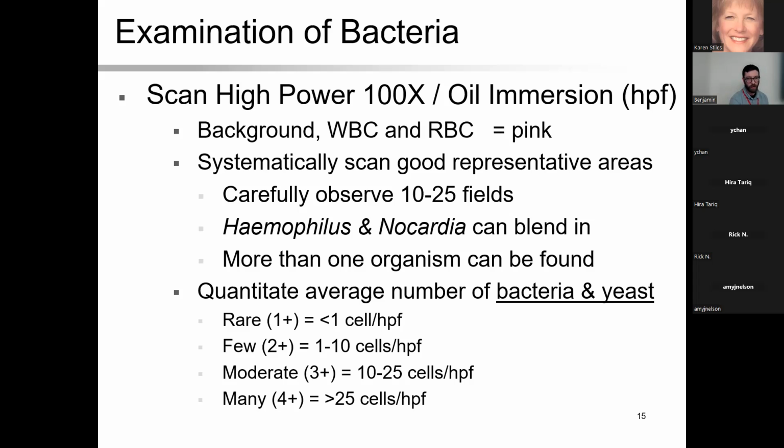So if you see 5 clusters of gram-positive cocci, we might say few gram-positive cocci in clusters as our quantitation for our report on this.